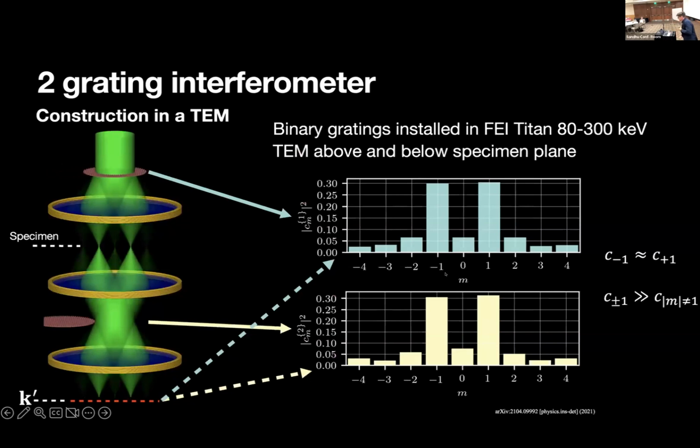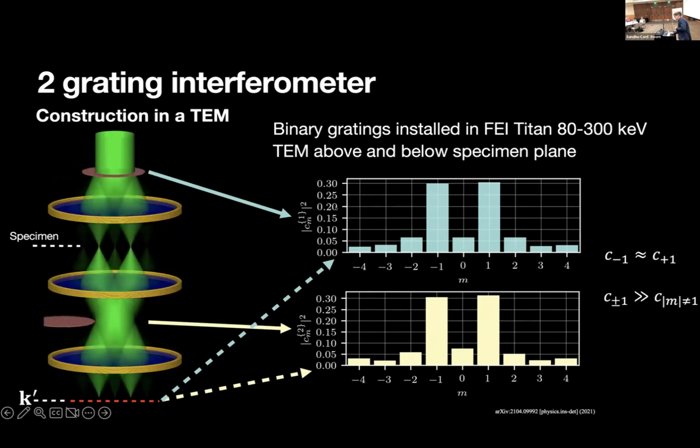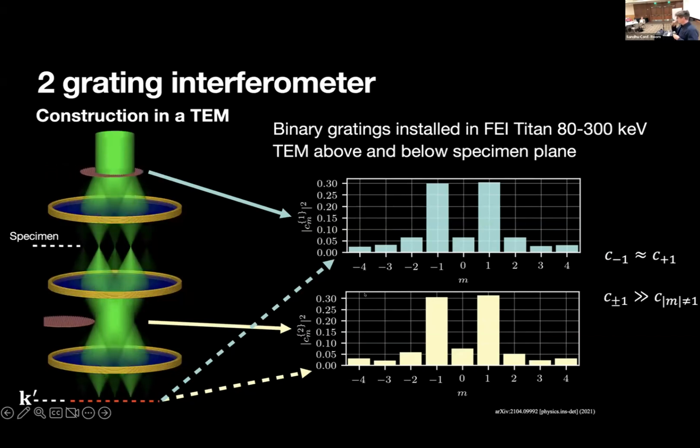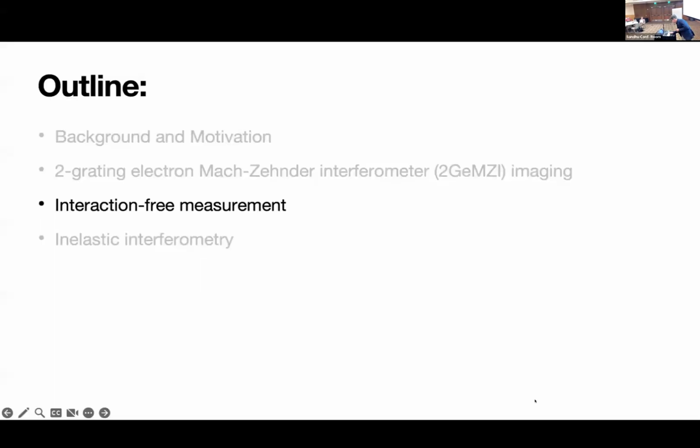Okay, so our one grating beam splitter isn't perfect. That's another stipulation. We're not just producing 2 beams, we're actually producing other higher orders too. We filter some of those out, but that's an A for us. And then likewise, our output grating is supposed to be symmetric and identical to the first one, sometimes it's not, but it also produces higher diffraction orders. Okay, so that's a Mach-Zehnder interferometer.